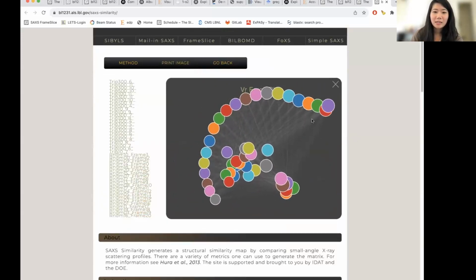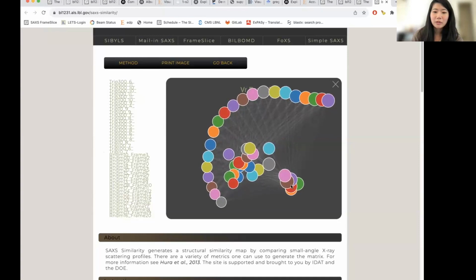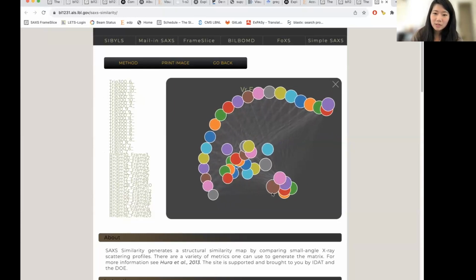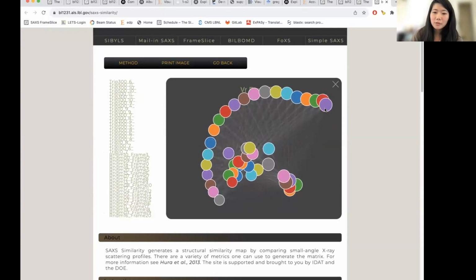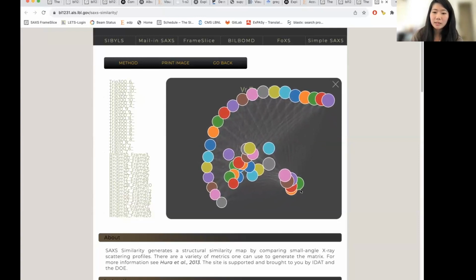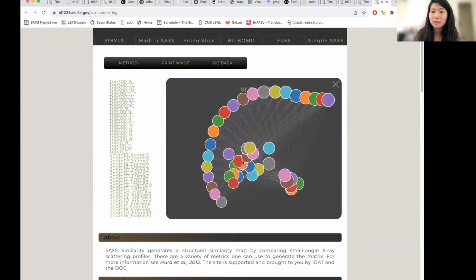So now we see that this combines what we saw earlier with the conformational change going from open to close, but also with the experimental data under different salt concentrations and pH. These ones, the RG is actually a lot bigger than the ones in the open conformation. So these are the aggregates that occur with high pH for these proteins. And these smaller ones correspond better with the actual conformational change that occurs as the salt and the pH changes.